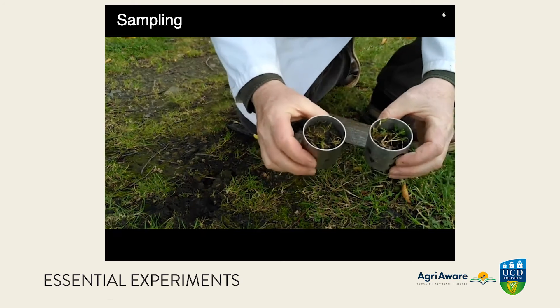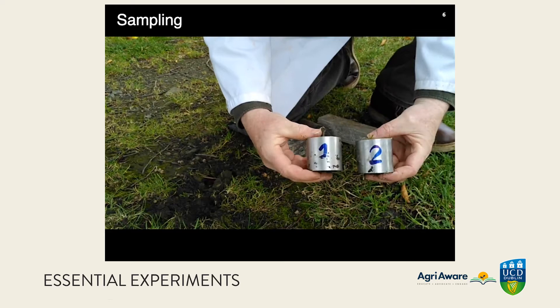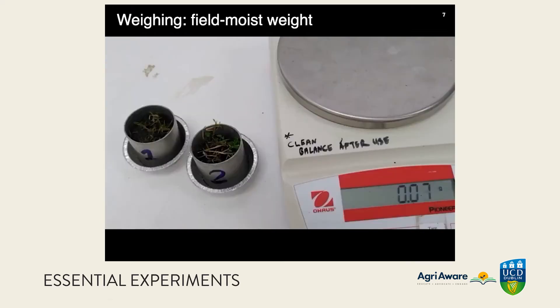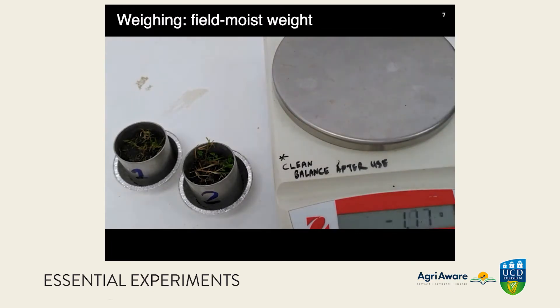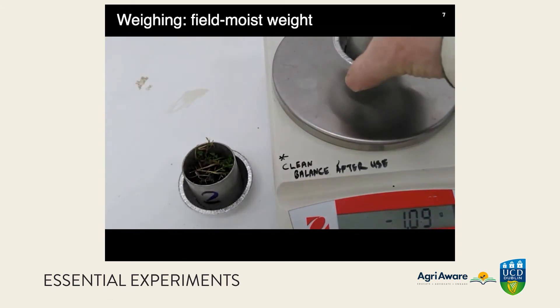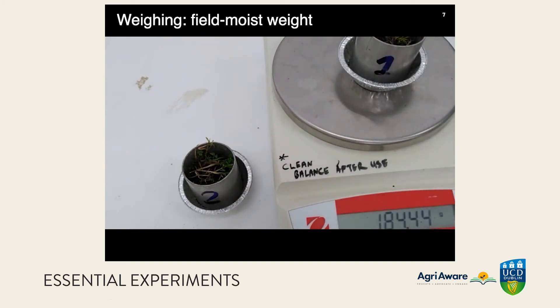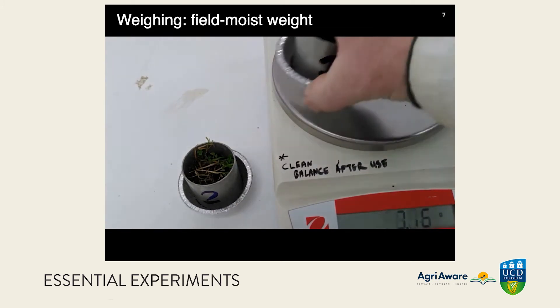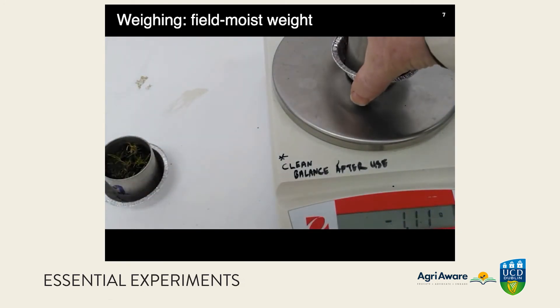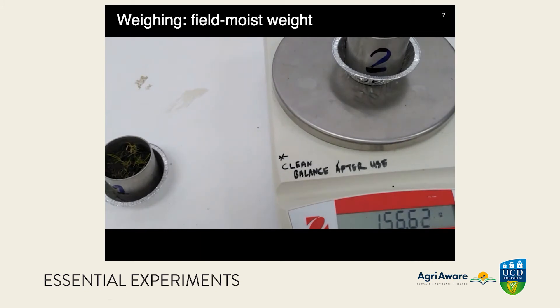Two soil samples are now ready to be taken into the lab — one is compacted. We need to weigh these now and set up the balance to ignore the weight of the foil tray. The balance is variable due to a draft in the lab, but we're only measuring to a precision of one gram, ignoring both decimal places. The field-moist weight of sample one is 184 grams — soil and ring, excluding the tray — and the weight of sample two, soil plus ring, is 157 grams.